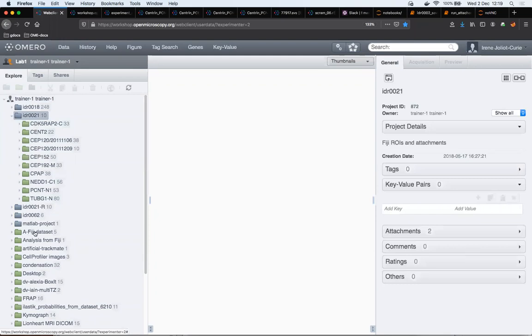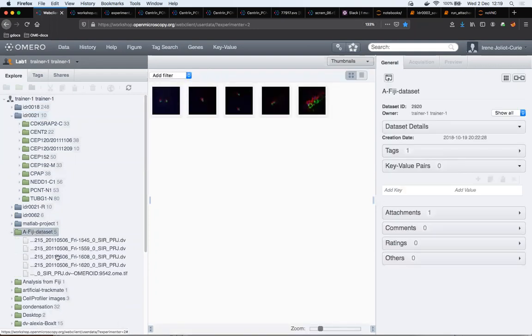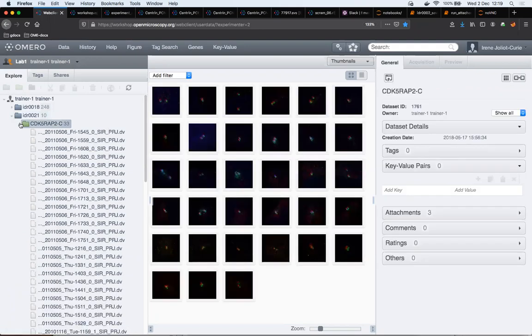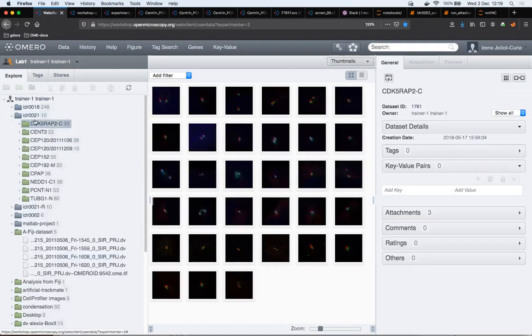is just kind of best off from the full study, and the study is the IDR 0021 published images, which are super resolution confocal microscopy of the centrioles, so subcellular structures.